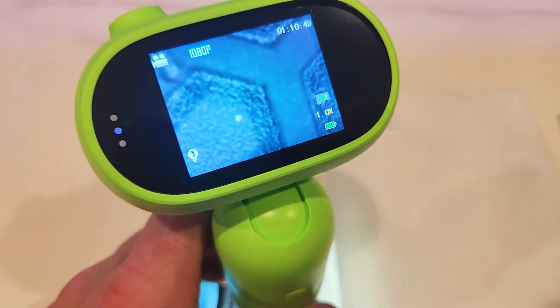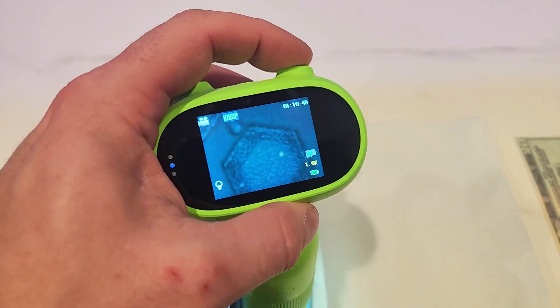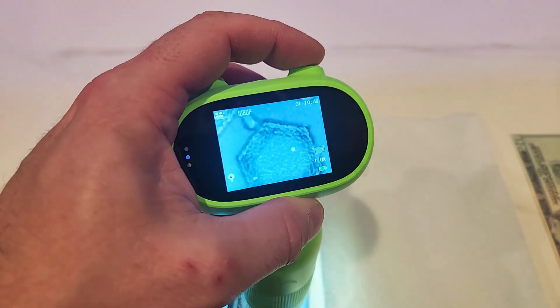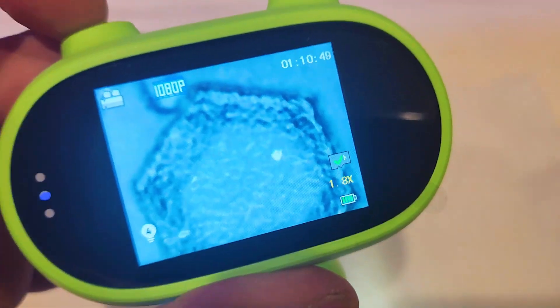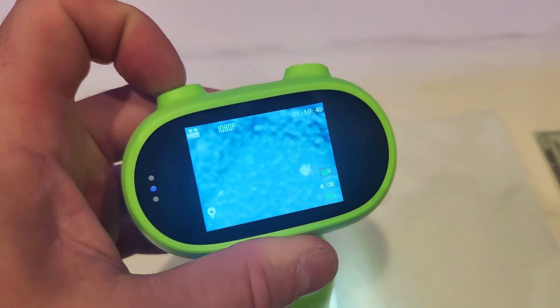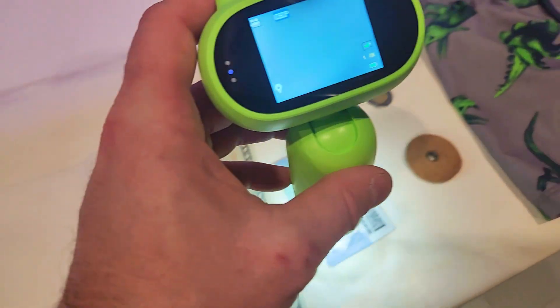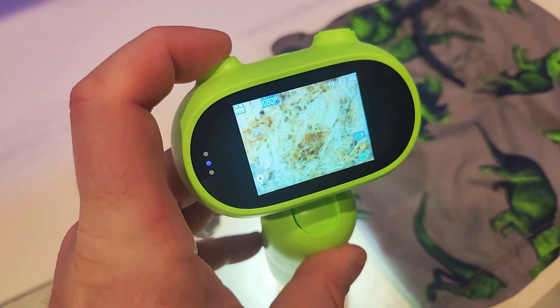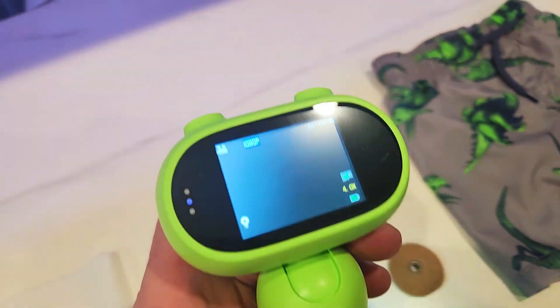If I pull away it gets blurry; if I go right on here you can see it clearly. When I press this arrow it adjusts the light brightness — there are four different levels of illumination. Now if I turn this other dial, it zooms in — see how it says 1.8, then 2.6 — and it retains the resolution, which is kind of neat. Now let's look at the wood. You can see the wood fibers right here, and we're zooming in further. You can also use the knob to further change the zoom level.